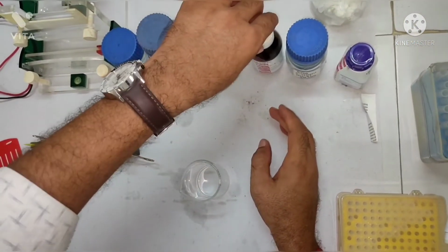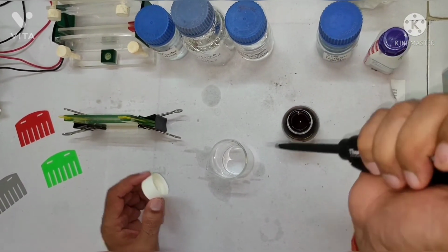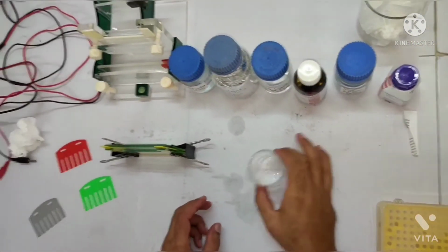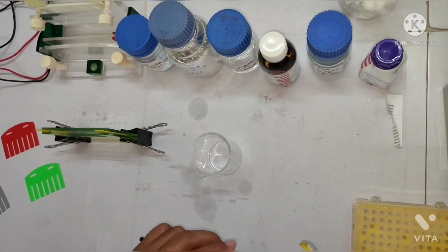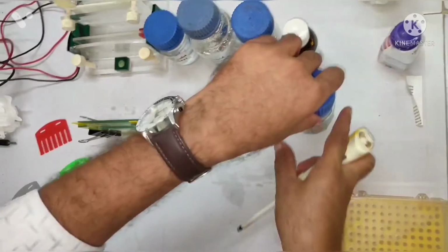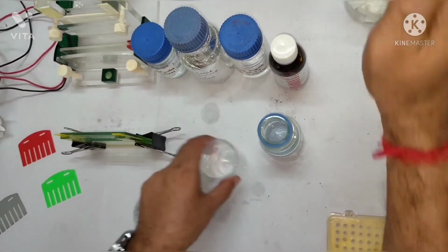Then the fourth solution is TEMED, and here 2.5 microliter we have to add. So just take the TEMED and mix it properly. Then the next chemical is 10% SDS, and this is 25 microliter. We have to add 25 microliter of the 10% SDS we already made. Mix it properly.